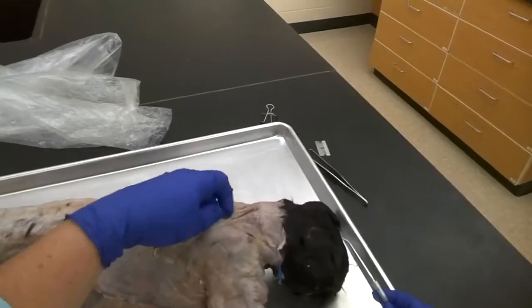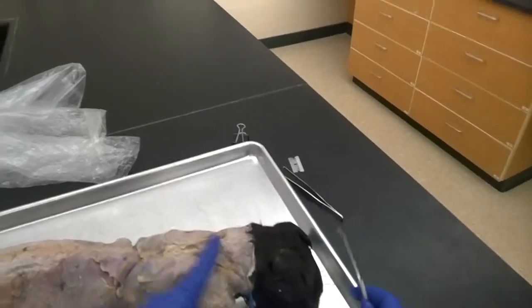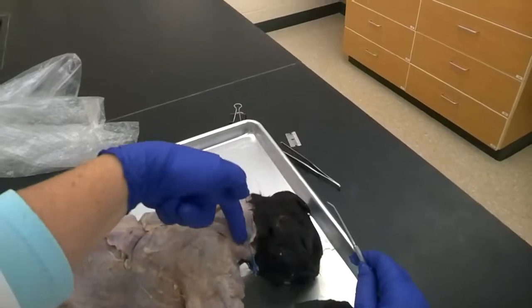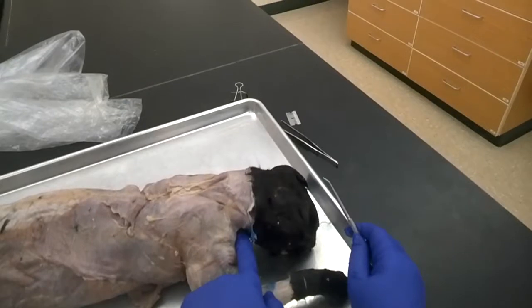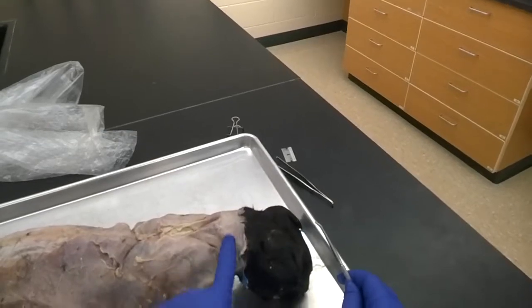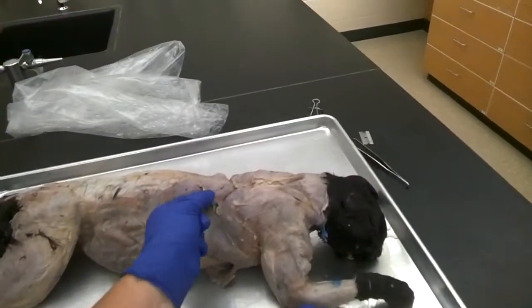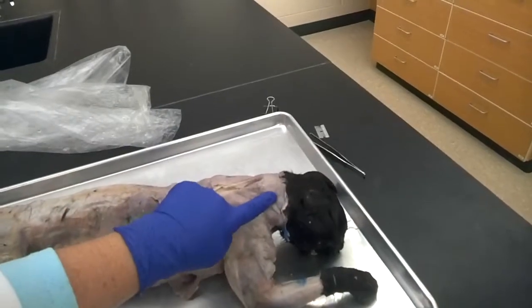There is no further dissection needed for the acromiotrapezius. Finally, we have the clavotrapezius, which originates back up in the neck, goes around and down, and connects to the clavicle — hence the name clavotrapezius. We don't have to do any dissection here; this is a muscle we just look at and know by sight. So you have these four muscles: latissimus dorsi, spinal trapezius, acromiotrapezius, and clavotrapezius.